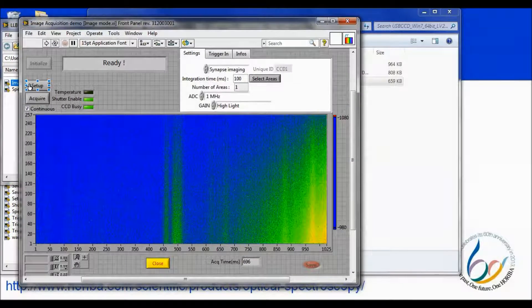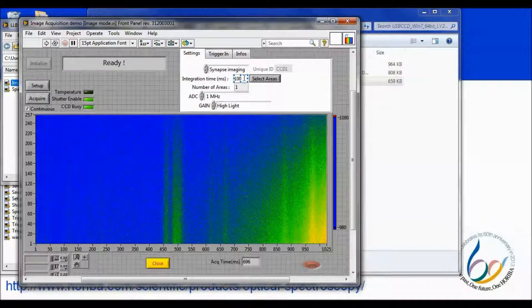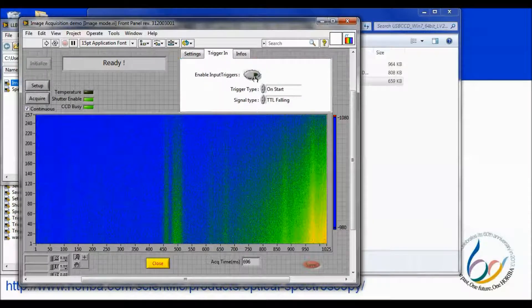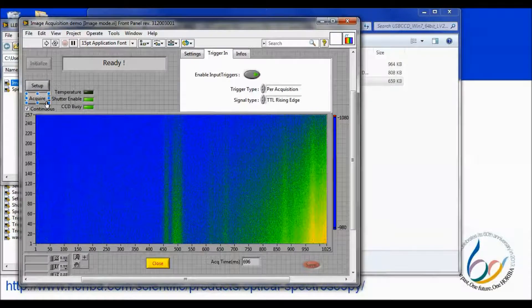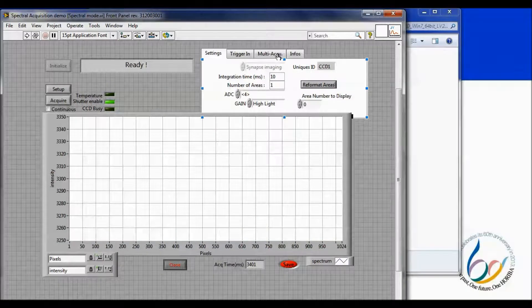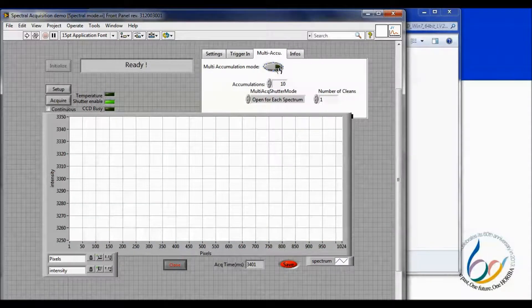If we look at the image mode VI, we see a settings tab where we may select our CCD, set the integration time, the number of desired areas, the ADC rate, and the gain. There is an additional tab for enabling input triggers and setting the trigger parameters. Clicking setup sends the parameters to the camera, and clicking acquire begins the acquisition. Spectral mode looks very similar, but in this case there is an additional tab for setting up multiple accumulations.